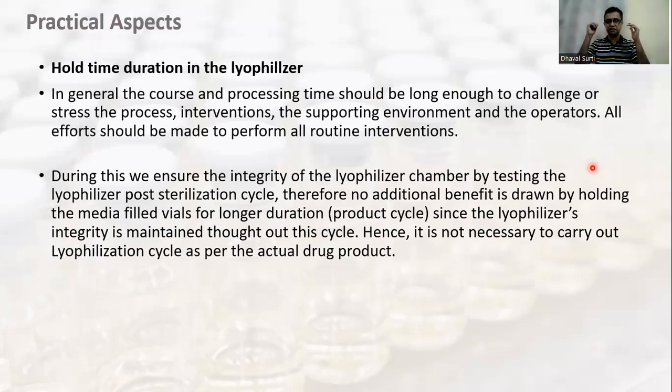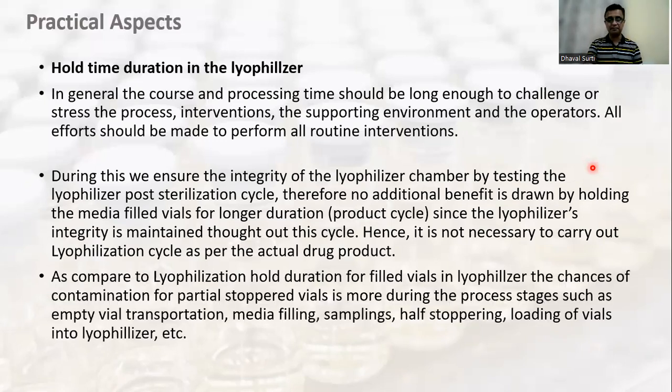It is integral for the lifetime, or not for the lifetime; I'll say it is integral for the product cycle. And after that, we are doing the post-sterilization integrity test of the chamber. So there will be assurance that the chamber maintains its integrity. So there is no need at all to simulate the entire cycle.